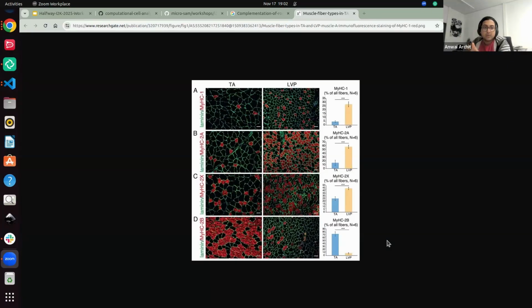The first stage would be to compute the embeddings on a GPU system. So find a laptop which is either a MacBook or has a GPU. If it's a MacBook, it should have these M chips. They are very good and, I wouldn't call it replicate, but they go in the direction of accelerating these deep learning architectures.